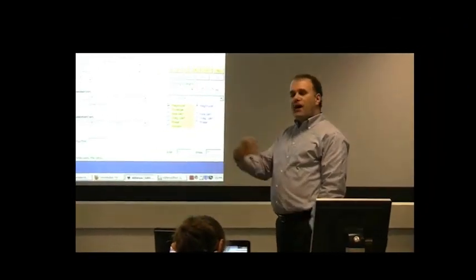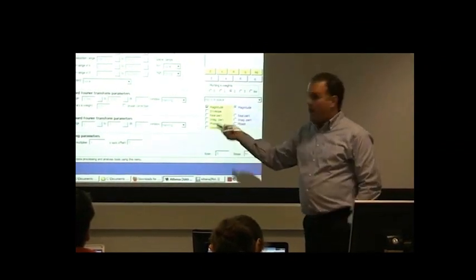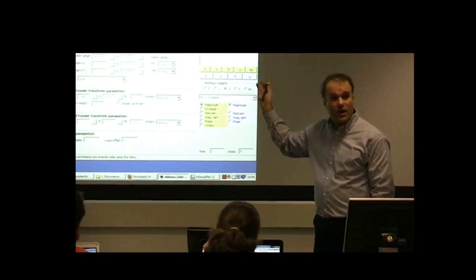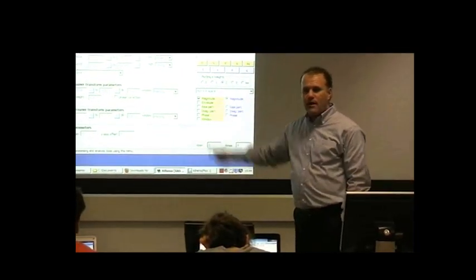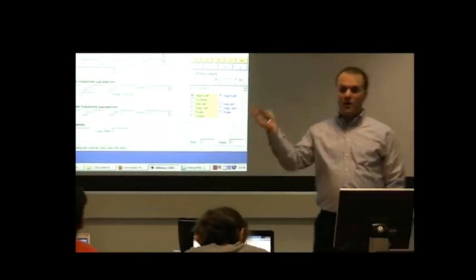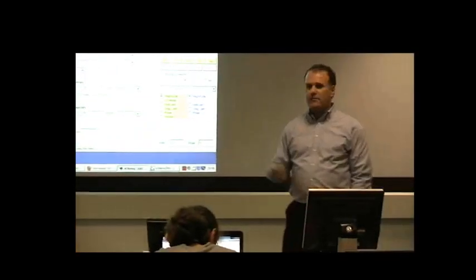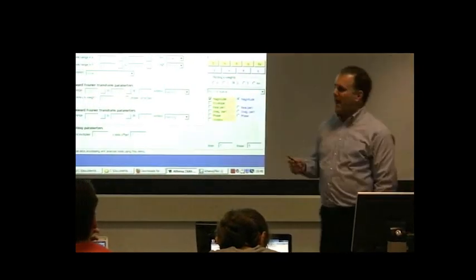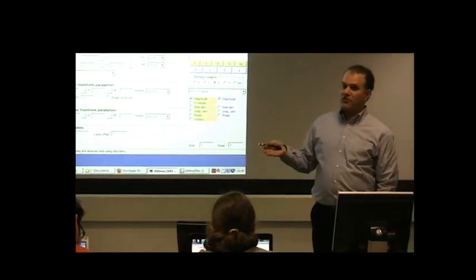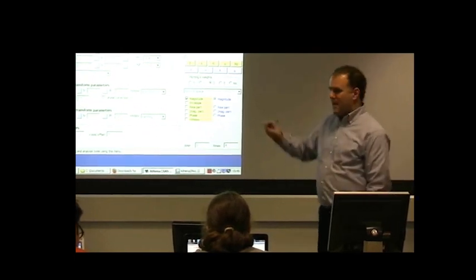You will find that for these data that are really, really good data, this number just doesn't matter. You'll do a fine job, in fact, basically the equivalent job, with this value as 1, 2, or 3. But you will find in real data that has real noise and real problems with it, that it is sometimes useful to do k-weighting of 3, and sometimes it works out better with k-weighting of 1. And truth to tell, it's always a little bit mysterious which data prefer 3 and which data prefer 1. But it's another one of the things that you can play with to make the background removal work out well.